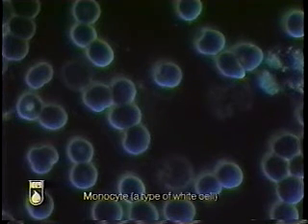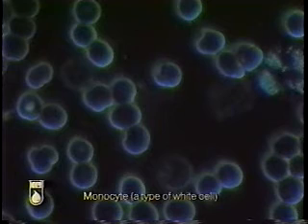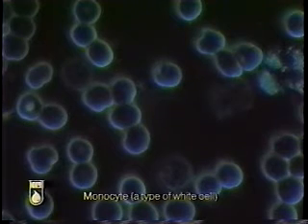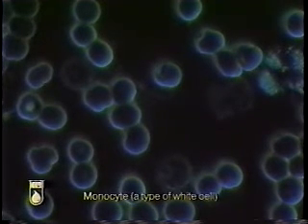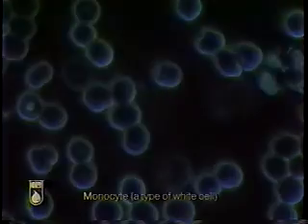We also note that the monocytes are characterized by having a number of inclusions or granules in their cytoplasm, and the nucleus is often in a large C shape. These particular cells are especially important in the cell-mediated immune function.